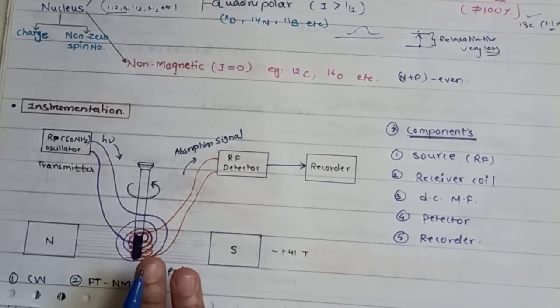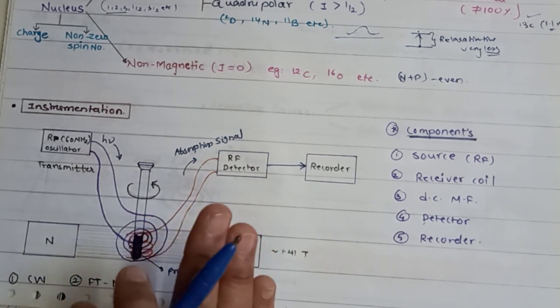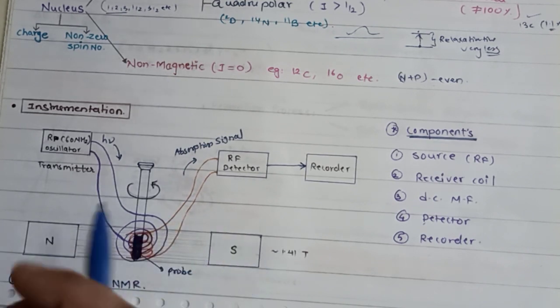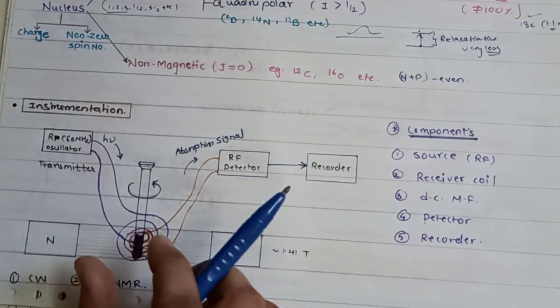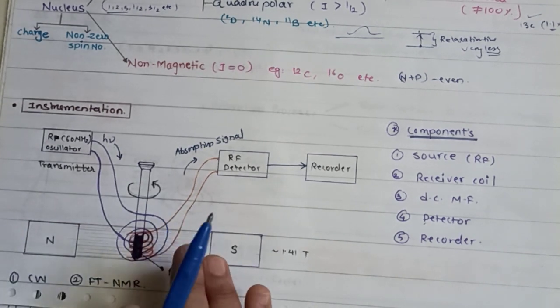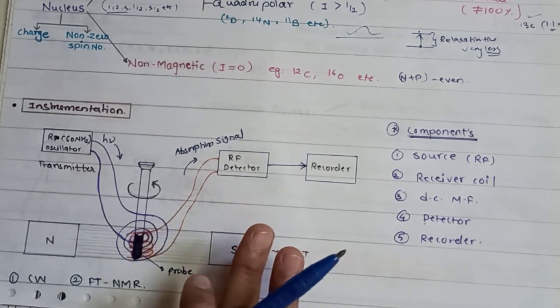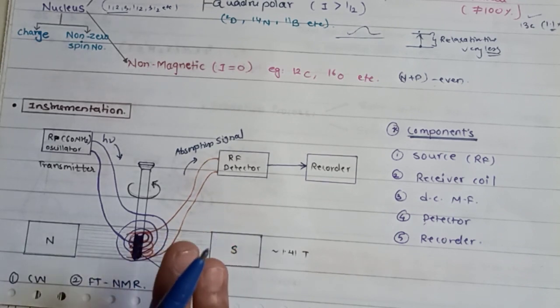Okay, second thing here: the nucleus of the deuterium also exhibits some nuclear spin definitely. Therefore, to resonate, it absorbs radio frequency radiation over a very different range of frequencies than your proton. So in an NMR spectrophotometer, a very narrow range of frequencies is used for the solvent system. Okay, so this was the third criterion, that is the solvent selection.